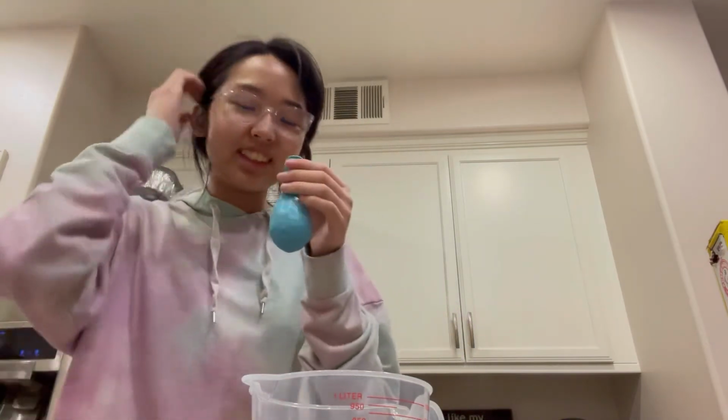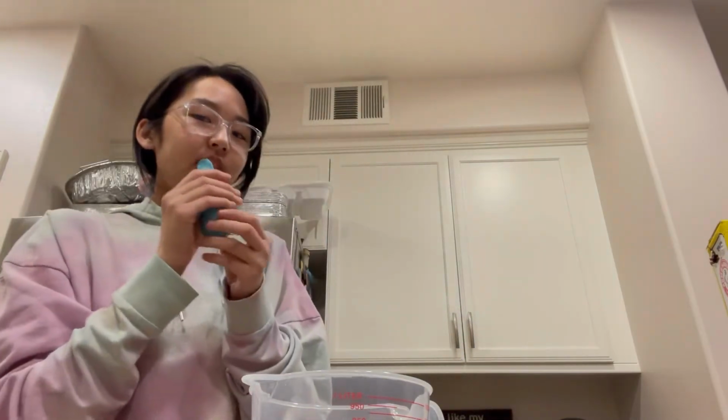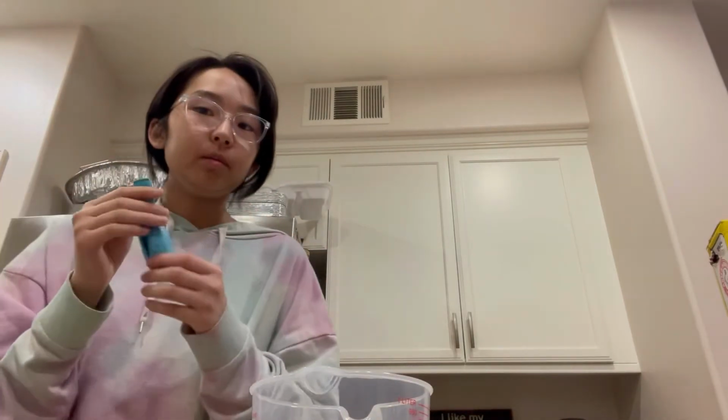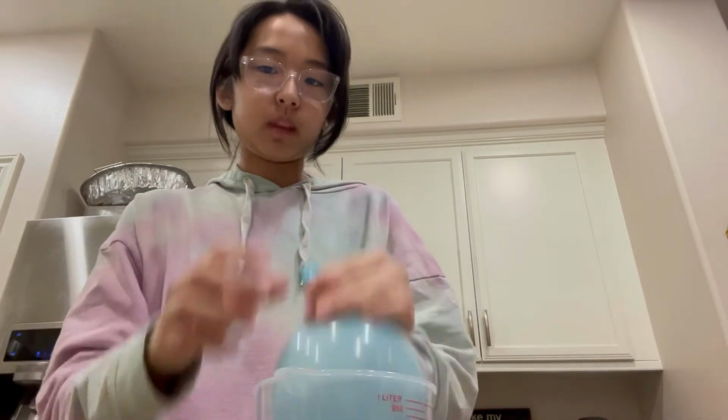So what I'm gonna do is blow up this balloon and then put it in this beaker and then put boiling water. As you can see, it's currently right behind me. So then we can see. Okay, that's good.